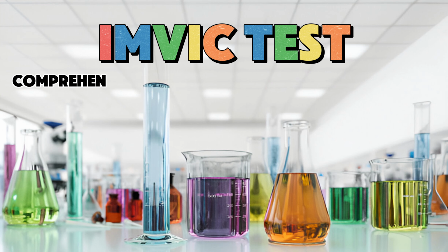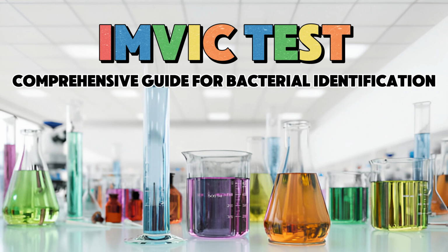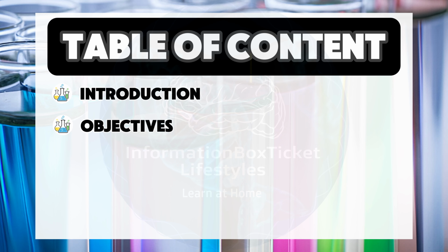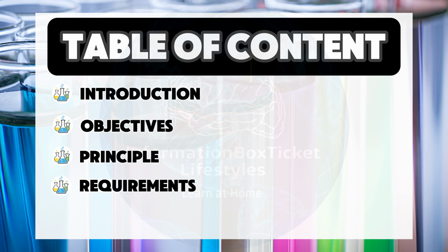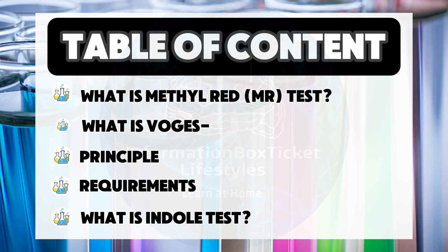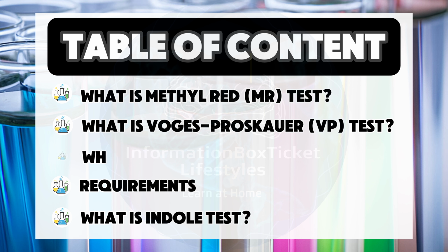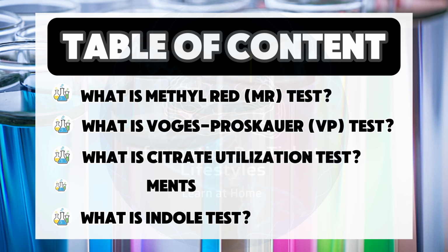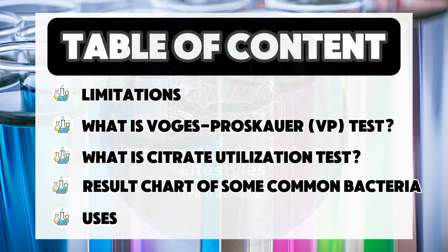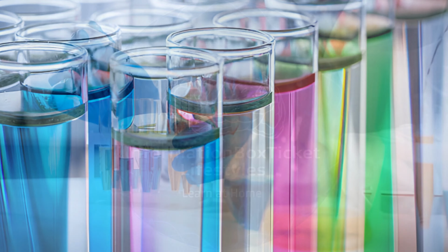IMViC test, comprehensive guide for bacterial identification. Table of contents. Introduction. Objectives of IMViC test. Principle of IMViC test. Requirements for IMViC test. What is Indole Test? What is Methyl Red test? What is Voges-Proskauer test? What is Citrate Utilization test? IMViC test result chart of some common bacteria. Uses of IMViC test. Limitations of IMViC test.